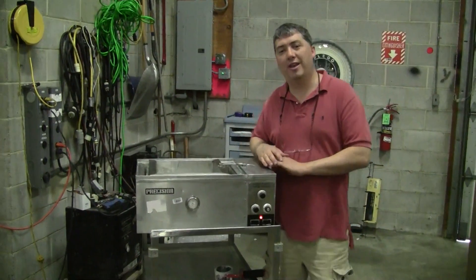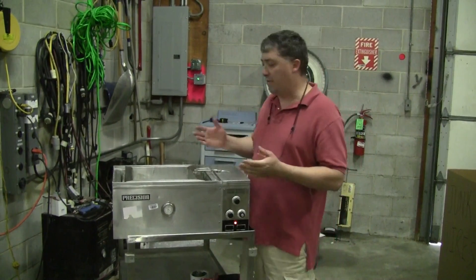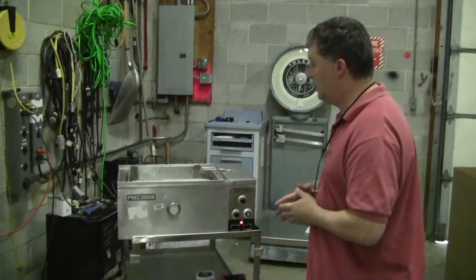Hi, this is Michael Nightow from High Tech Trader. Today we are looking at a shaking water bath. This happens to be an older shaking water bath, but a classic nevertheless.